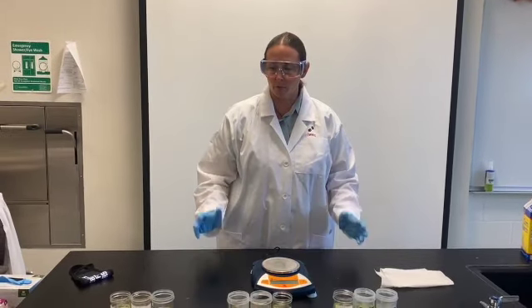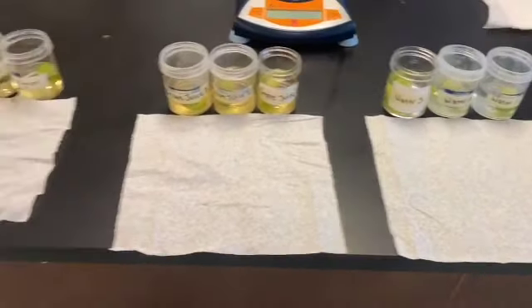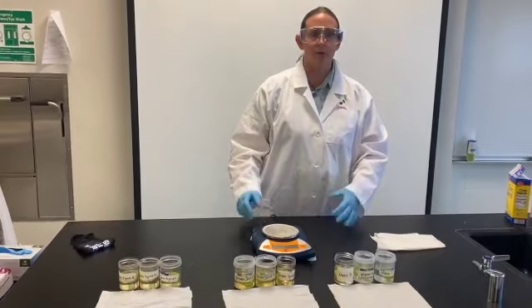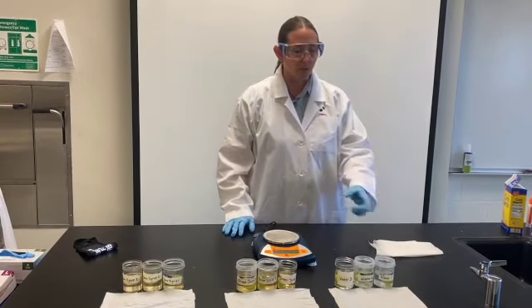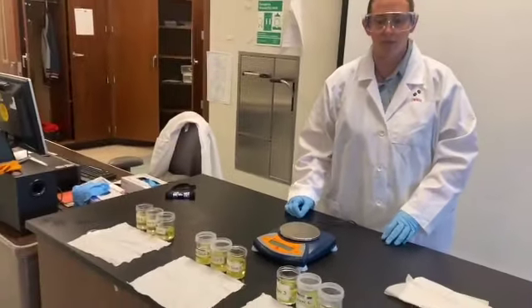All right everyone, so the grapes have now sat in their various solutions overnight. We are going to weigh all of the grapes and also put them on the pieces of paper so that you can make observations about changes that may have occurred. I'm going to weigh the first one here on camera and then the rest of the weights you will find in your data table.